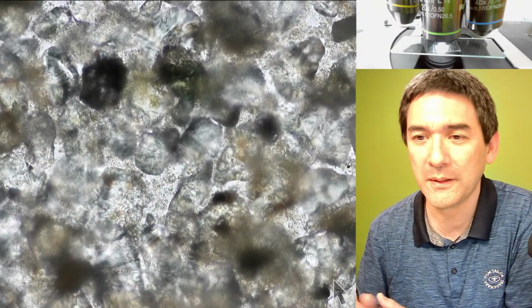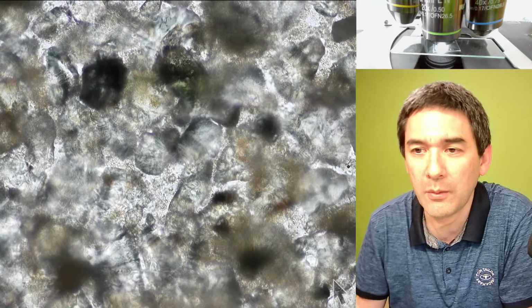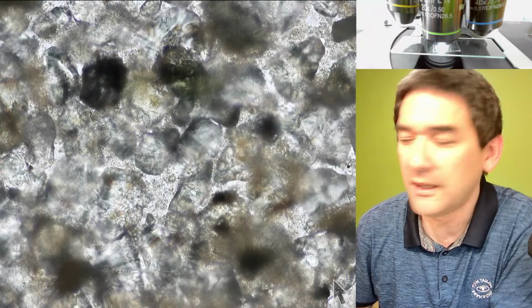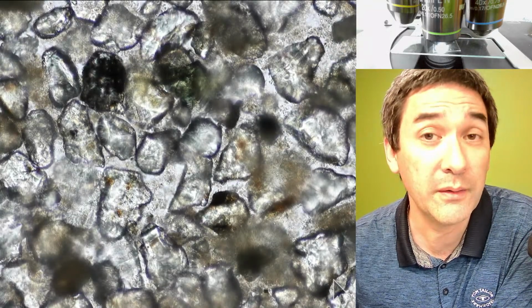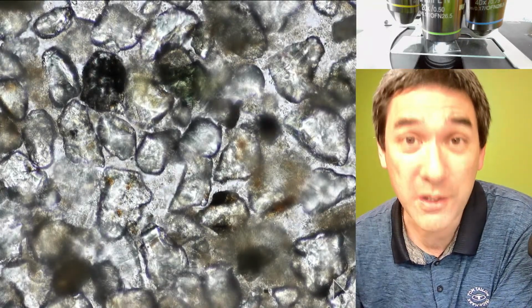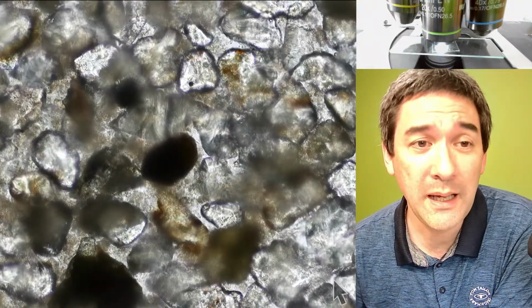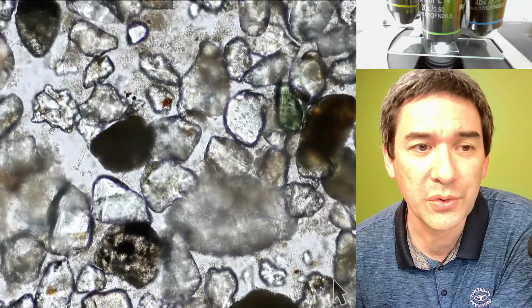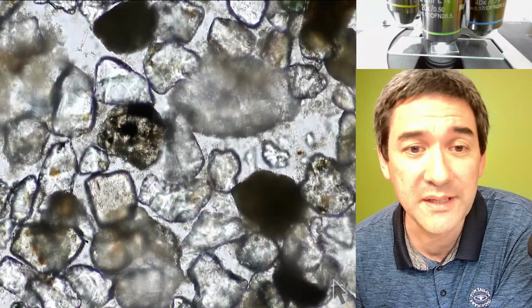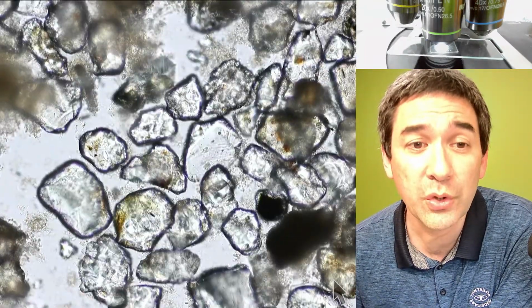and no movement. So somebody's asking a question: what's the benefit of using polarized light? If you're using polarized light, some specimens look very pretty. Check out my crystal videos. You can also determine if there are certain crystals in a sample, for example, starch grains or crystalline structures. So you can make certain things visible which are otherwise not so easily visible.